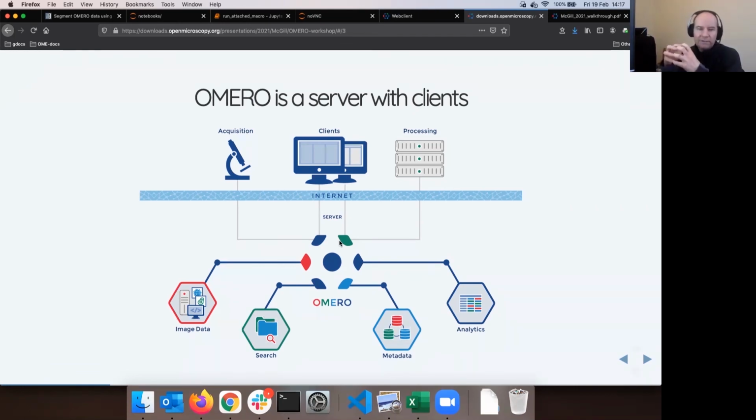Well, that server also had to start as a baby, which was just software, Omero server as software, and had to be put on hardware. But this was done by the Ome team, and this is an exceptional situation. The Ome team did that in order to be able to run workshops. That's why this training server exists. That's its sole purpose, and that's why the data are there as they are.